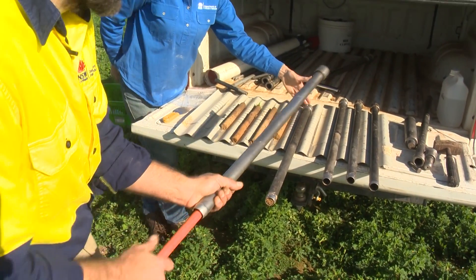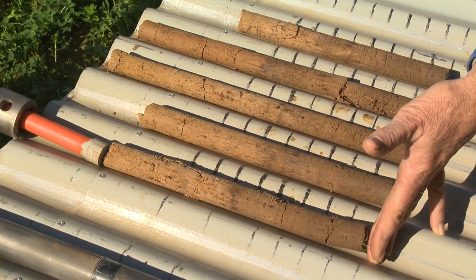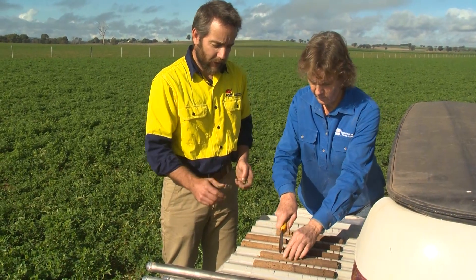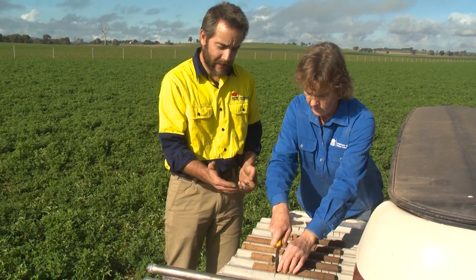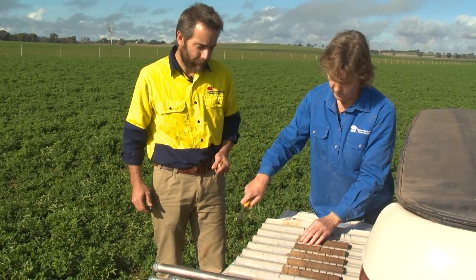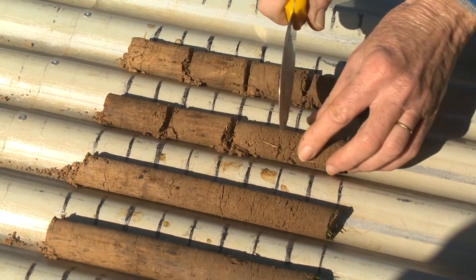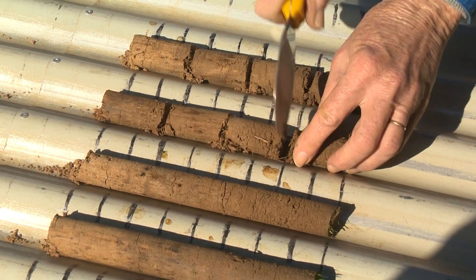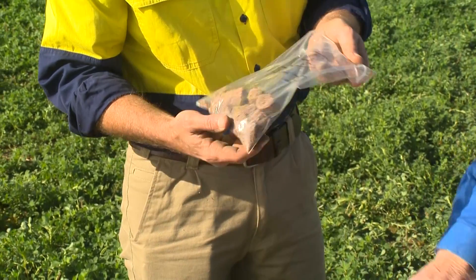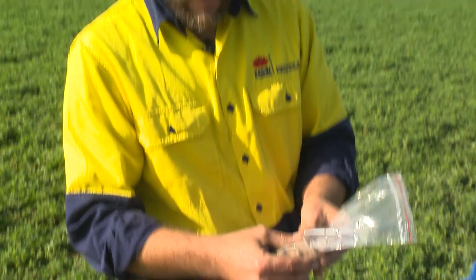You can use anything to push the cores out — this is just a bit of electrical conduit. Once they're on the tray, we can cut the cores up into the layers that we want. In this case we're just doing the top 20 centimeters, discarding anything lower, but you could easily keep that if you want. If we're sampling in 5 centimeter depth intervals, it's just a matter of cutting the cores and then we have a 5 centimeter depth interval — for example, 15 to 20 centimeters — and we can crush that up.